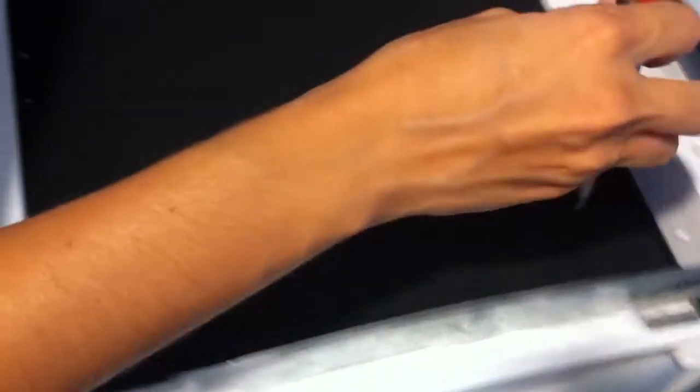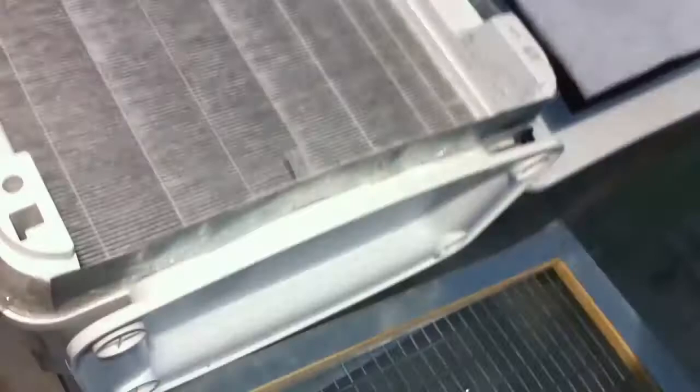And this very dirty carbon filter — this part is made by the manufacturer so we didn't modify anything. It has just a carbon filter with a plastic frame like this.